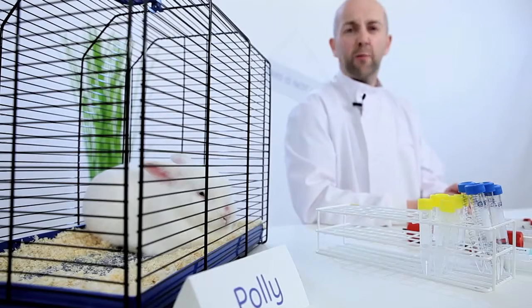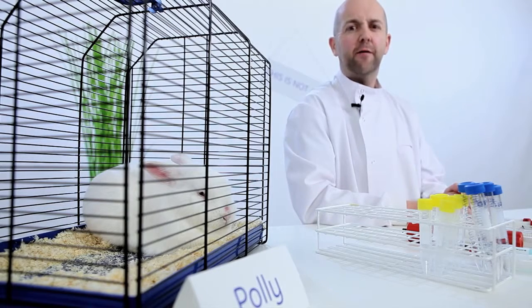Avoid the problem by collecting your antibody into tubes containing 1 molar tris HCl at pH 9. The final pH of your eluted antibody will now be around neutral, and your precious antibody will be safe. Alternatively, neutralize the pH with buffer exchange immediately after elution, using pre-packed Sephadex columns.